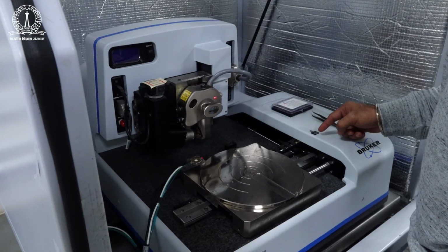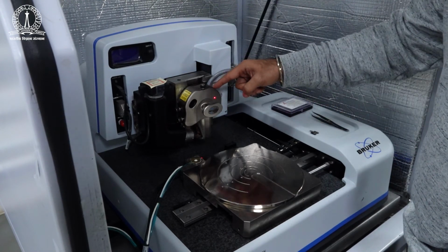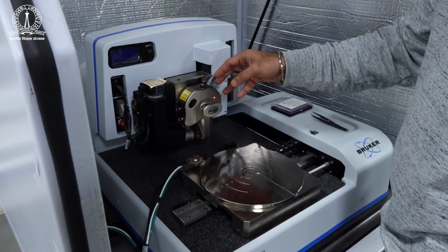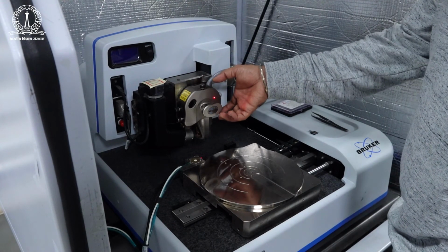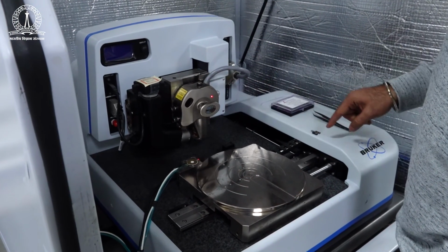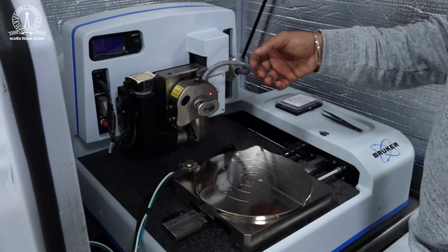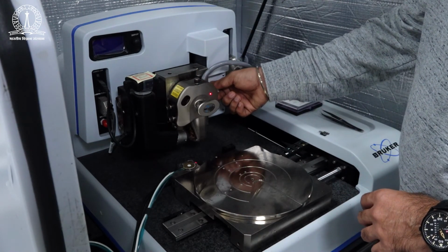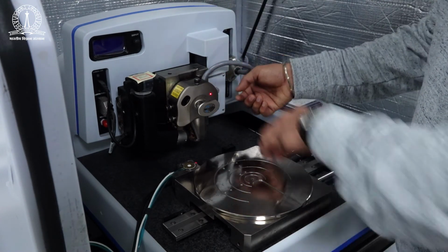So the tip has been loaded onto the tip holder, and this tip holder after the loading needs to go onto this scanner head. This scanner head is the most crucial part of the machine because it has a piezo scanner inside, and this piezo scanner can get damaged very easily with any small impact on it. So one should be very careful while handling it. So what we'll right now do is load this tip holder to the scanner head with good caution, very carefully. So how we do it is, there is a screw here to unscrew it so that it loosens up. Then we will take it up and then load it.